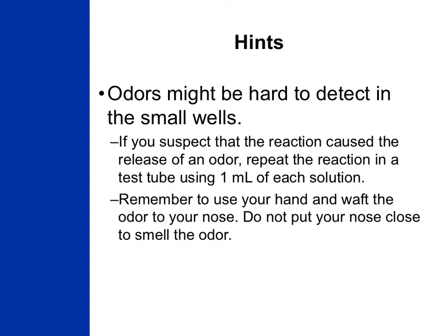If you suspect a reaction releases an odor, you may want to repeat that reaction in a test tube or in the larger well plates using a little bit more solution. And remember, proper technique when you're smelling a solution is to waft the odor towards your nose and not to put your nose right into where you think the smell is coming from.